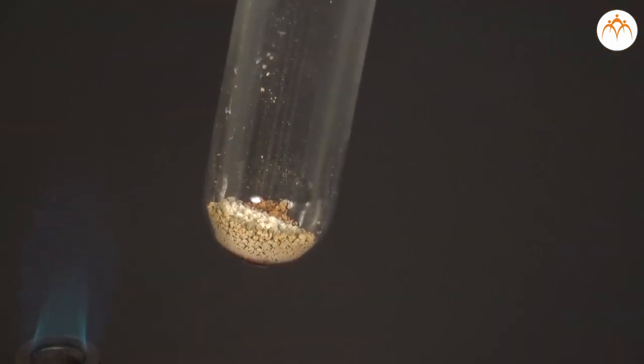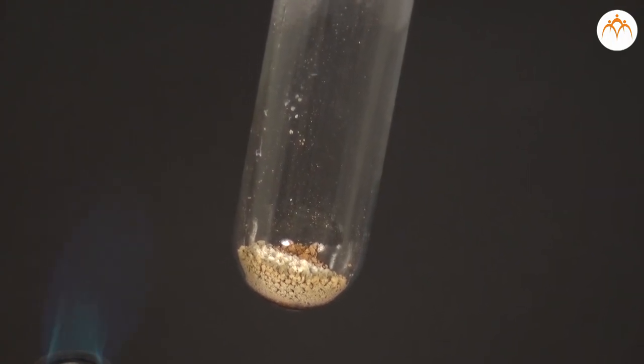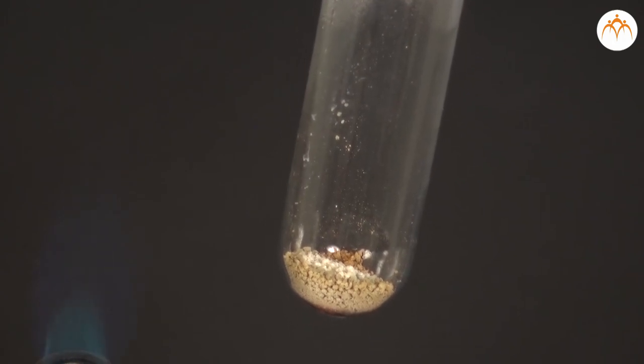On heating, the pale green coloured crystals of ferrous sulphate undergo decomposition. A mixture of ferric oxide Fe2O3, sulphur dioxide SO2, and sulphur trioxide SO3 are formed. A residue of brown colour remains in the test tube.